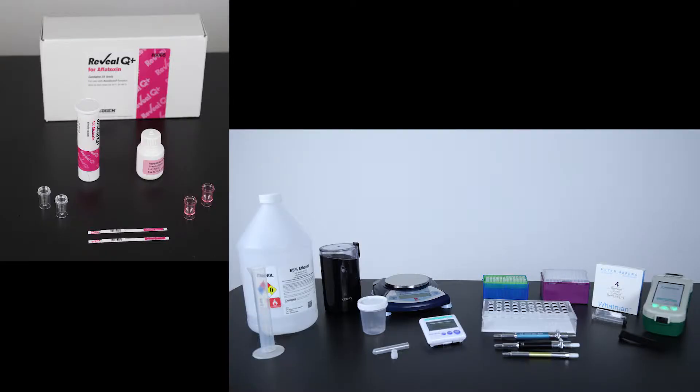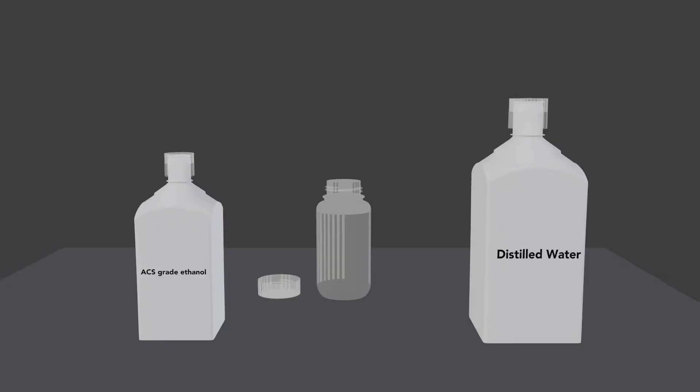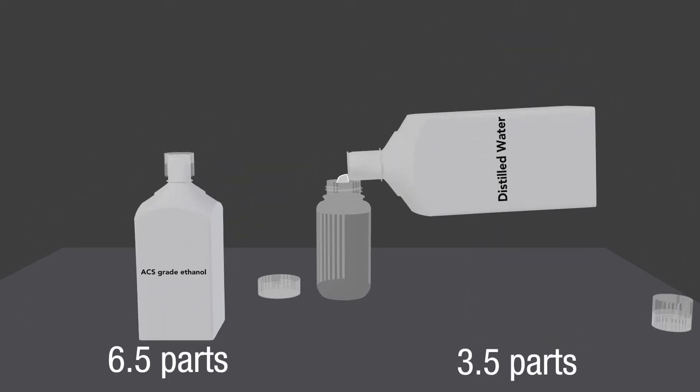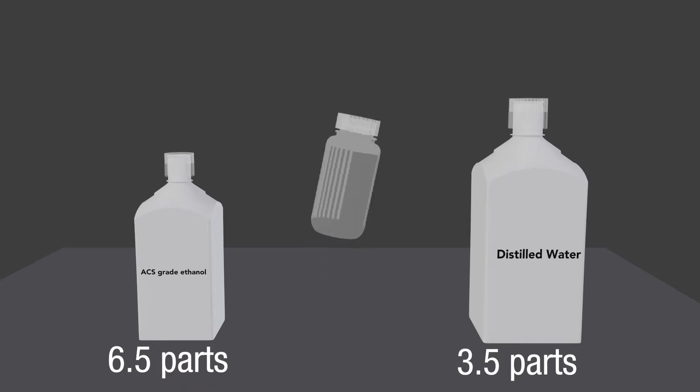To prepare the sample, begin by gathering all the materials required. If not using Neogen's prepared solution, make a 65% ethanol solution by mixing 6.5 parts ACS grade ethanol with 3.5 parts distilled or deionized water for each sample.